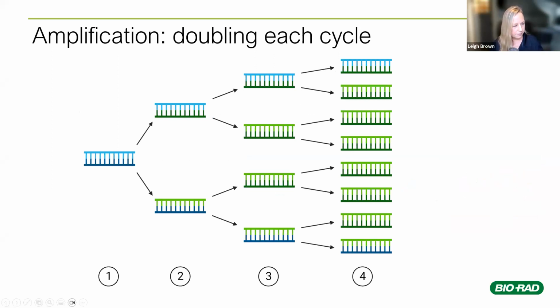And so if you look at cycle number 3, here's really the first time in the middle here. This guy, here's our 2 complete newly synthesized strands of DNA, right here. These still have a strand of the original starting template DNA. And then by cycle 4, we have even more of those. Okay, and of course, this goes on for 35 to 40 cycles.